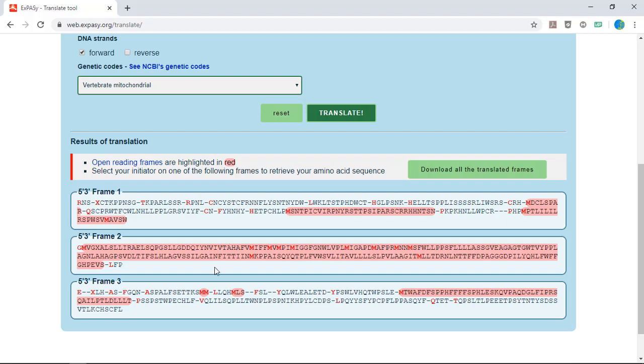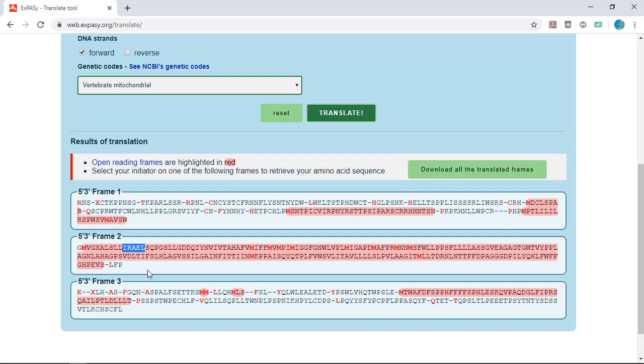Something else that can help you identify the correct reading frame is to look for characteristic, conserved, and very recognizable amino acid sequences we expect to see in the CO1 protein. For example, here we see a string of Ls corresponding to the amino acid leucine. There's another characteristic sequence upstream of that that always jumps out at me because it almost looks like Israel, right here: I-R-A-E-L for isoleucine, arginine, alanine, glutamic acid, and leucine. See if you can find those in your sequence to help you identify the correct reading frame.